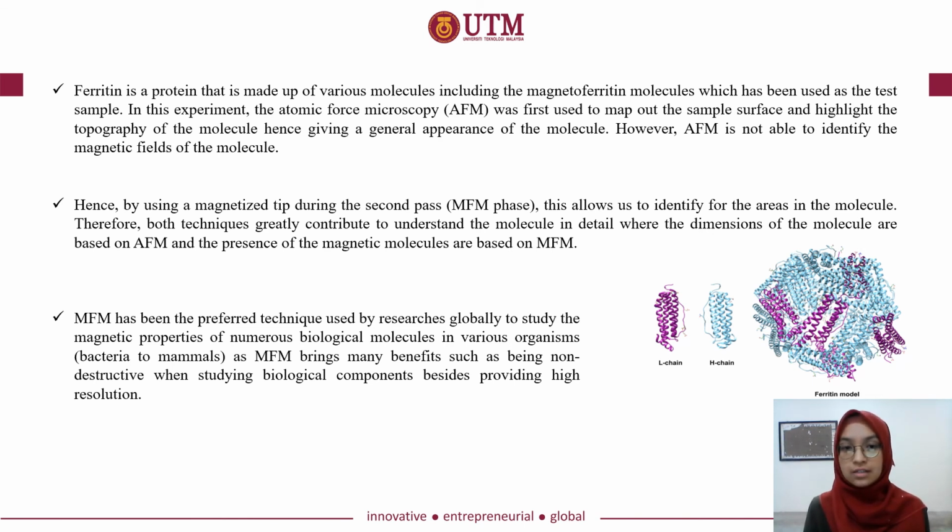Therefore, both techniques of AFM and MFM greatly contribute to understanding the molecule in detail, where the dimensions of the molecule are based on AFM, while the presence of the magnetic molecules is based on MFM. As we know, MFM has been used as the preferred technique by researchers globally to study the magnetic properties of numerous biological molecules in various organisms, from bacteria to mammals, because it brings many benefits such as being non-destructive when studying biological components, besides providing high resolution.